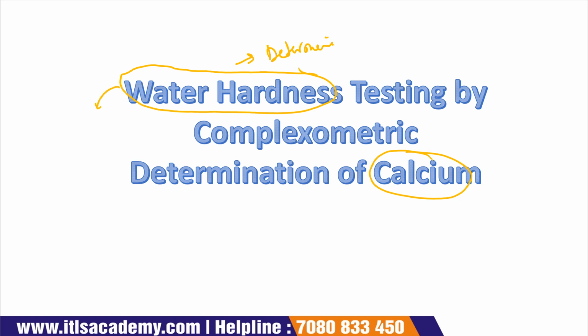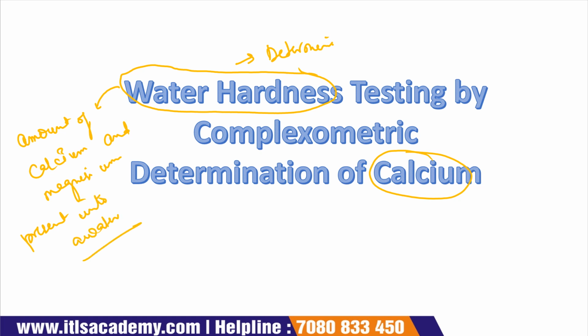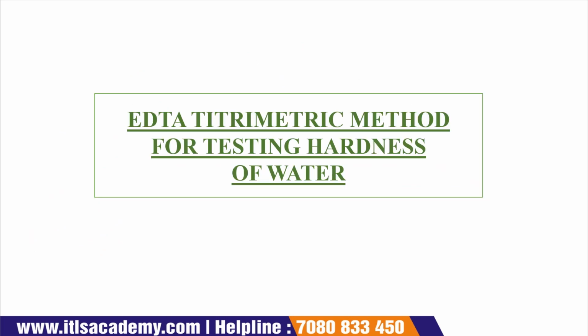Now, what is water hardness? Water hardness means the amount of calcium and magnesium present in water. It is defined as water hardness. We use two methods for the determination of water hardness. Here we are using the first method, that is the EDTA titrimetric method for testing the hardness of water.